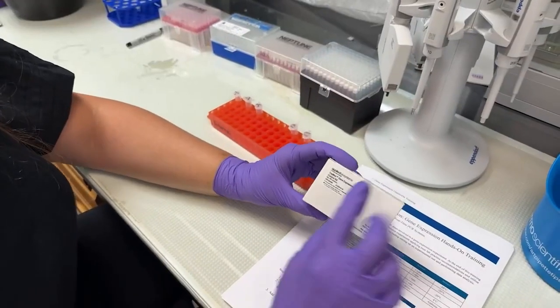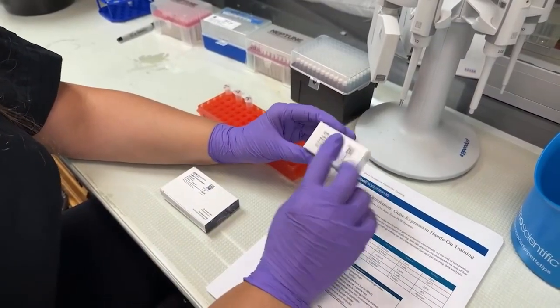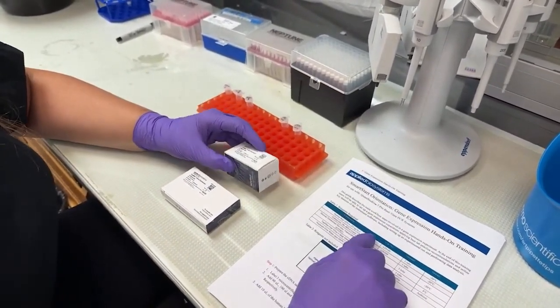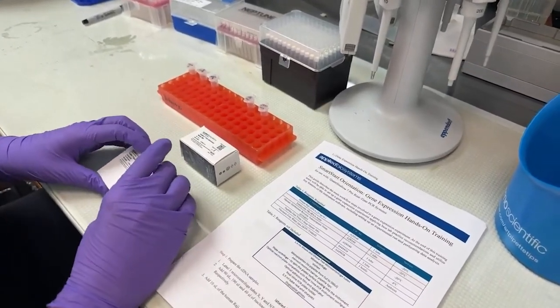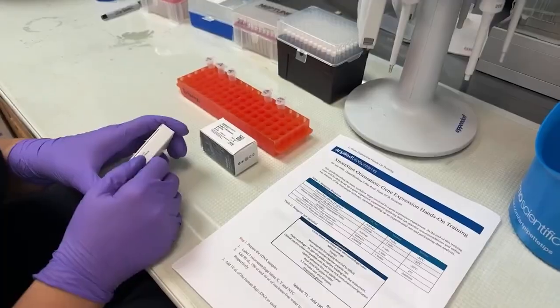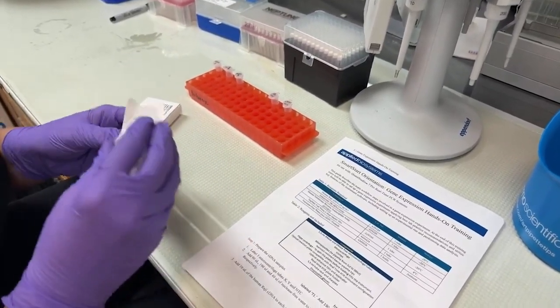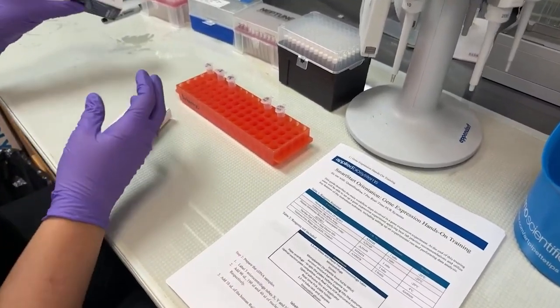So today we are going to do an experiment using a control kit, the TaqMan Gene Expression Control Kit and TaqMan Fast Advanced Master Mix, to do an example of what a gene expression experiment is going to look like. When we were in the conference room, we talked about master mix, and this is one of our pre-formulated, one of our favorite 2X master mixes.